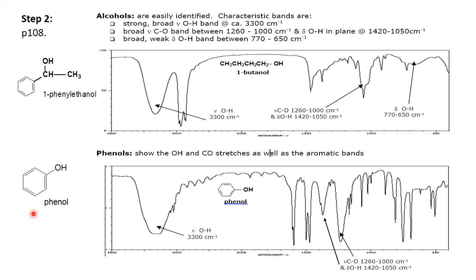Step two, the generic scans. The upper scan is an alcohol, in this case one butanol, and the lower scan is a phenol. In fact it is the mother of all phenols, the compound named phenol, and they certainly have a lot of similarities.